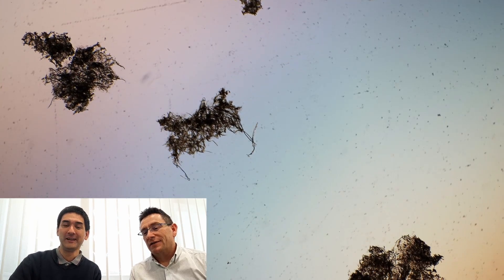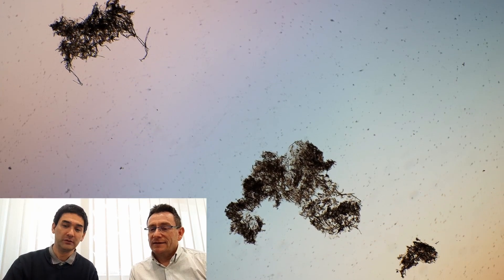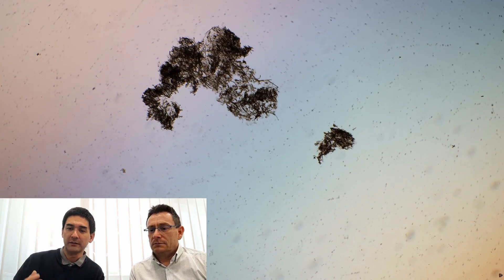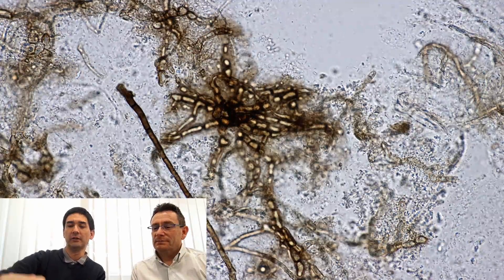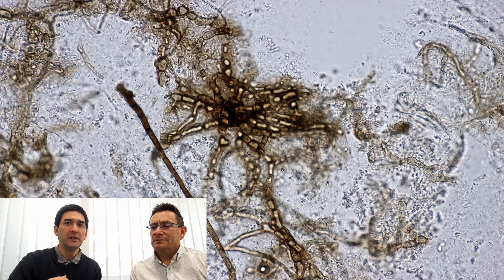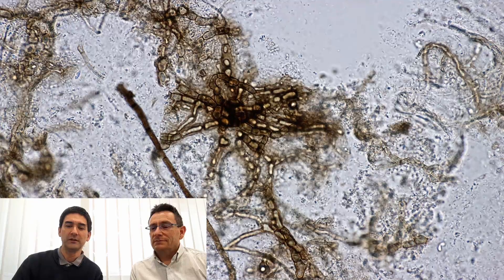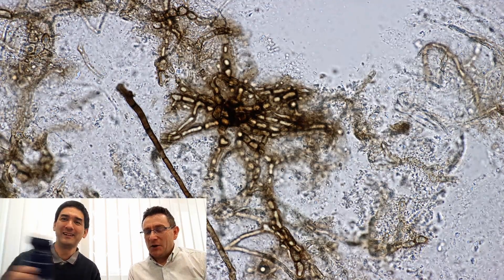These are not algae — these are actually a fungus. Mold, or maybe even different types of mold species. Especially over here you can see the individual cells, and they're kind of like fibers — they're long, they're filaments. These are called the hyphae of the fungus. So yes, it's mold. You've been growing mold in your bottle.